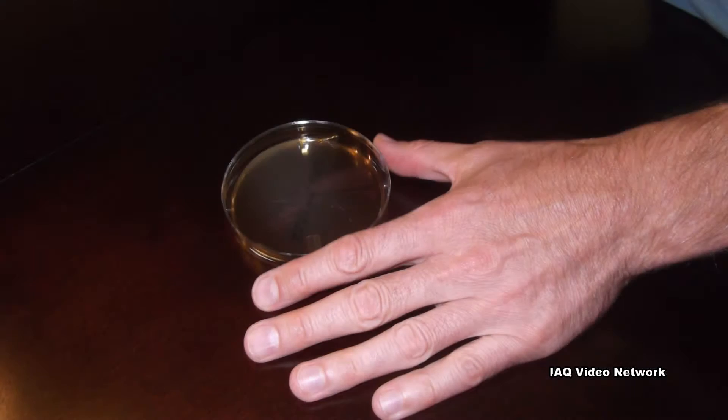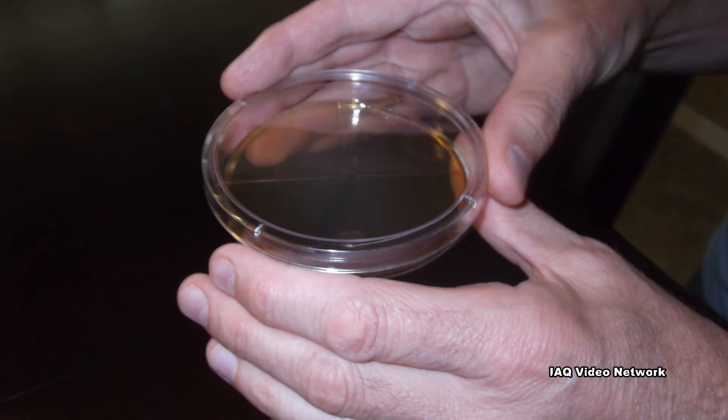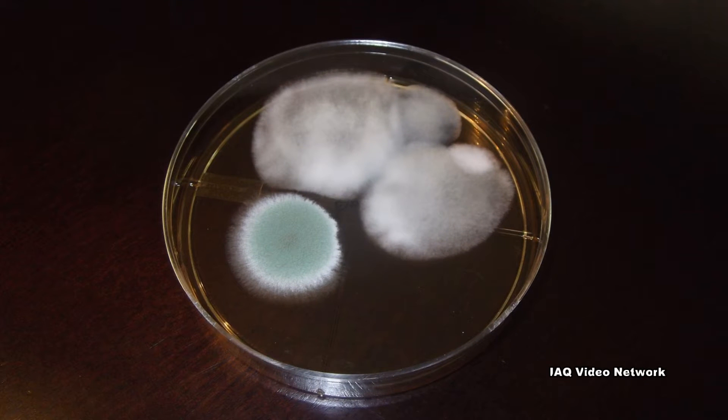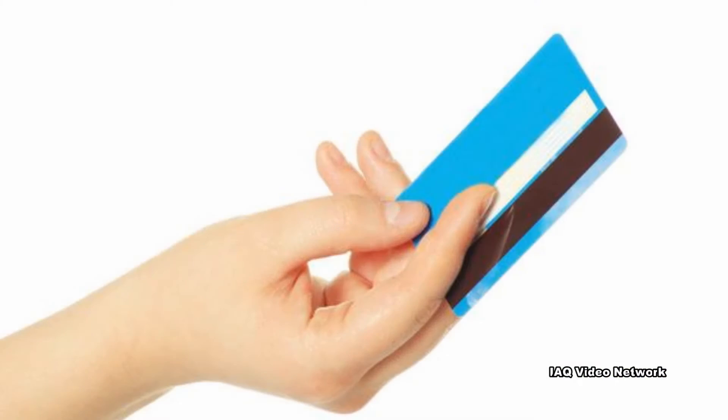People are instructed to leave the plate out for a specific amount of time and then put the lid back on and monitor for any mold growth over specific time periods. If mold is found to be growing, the consumer then has the option to send the petri dish to a laboratory to have it analyzed, usually for an additional fee.